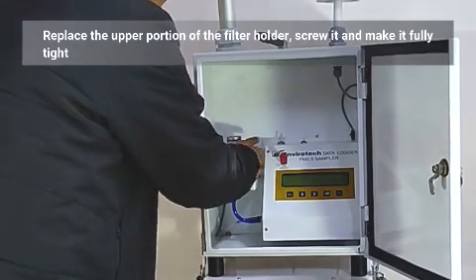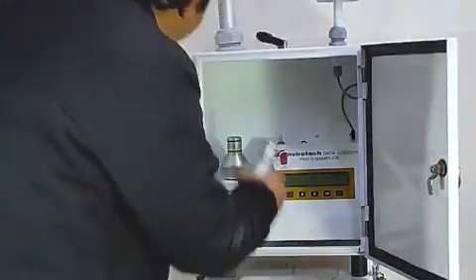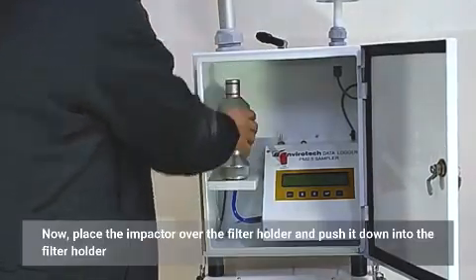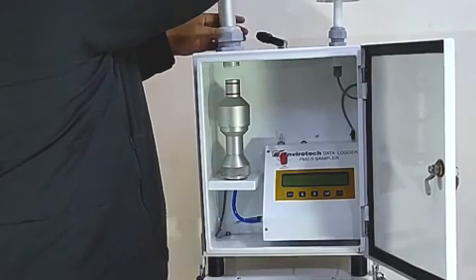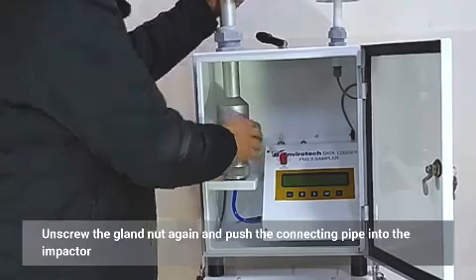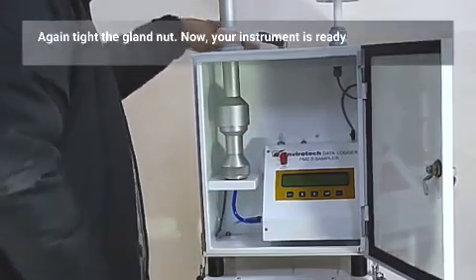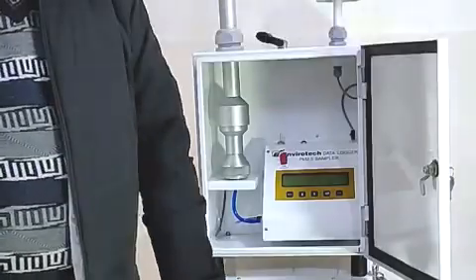Replace the upper portion of the filter holder, screw it and make it fully tight. Now, place the impactor over the filter holder and push it down into the filter holder. Next, unscrew the gland nut again and push the connecting pipe into the impactor. Again, tighten the gland nut. Now, your instrument is ready.